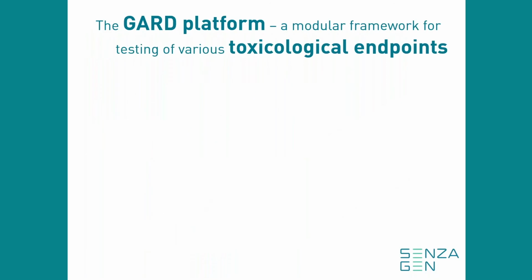So what I really would like to emphasize in this presentation is that the GARD assay is not actually one single assay, but rather a testing platform on which you can base a number of different toxicological endpoints. All the assays that we have available today share the same common structure.